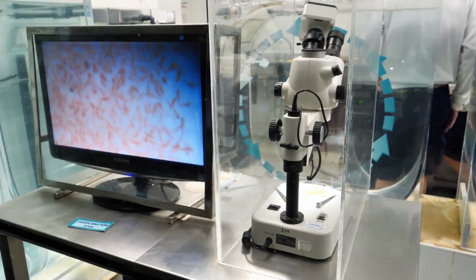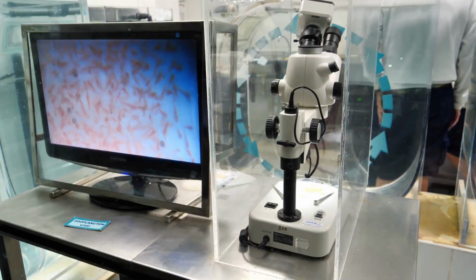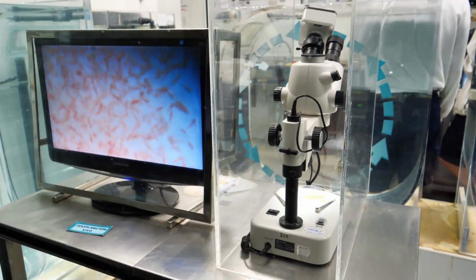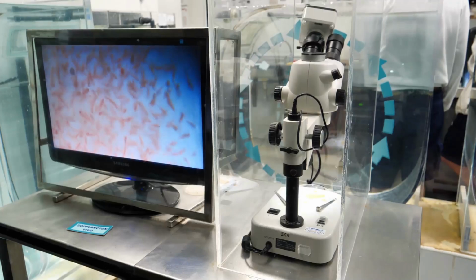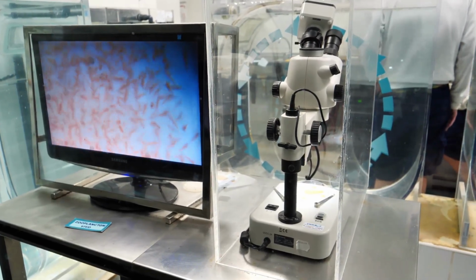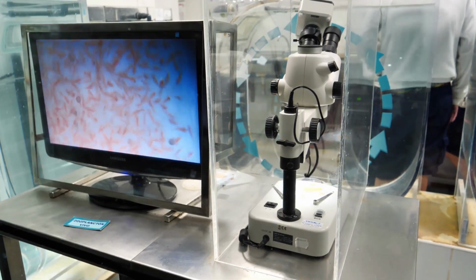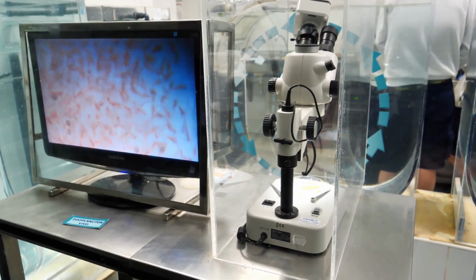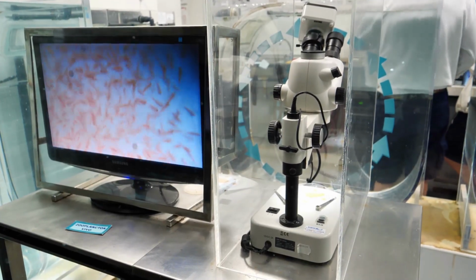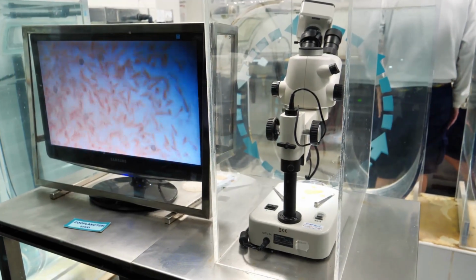Turn to an electron microscope when your absolute top priority is detail. If you need to see the precise structure of a virus, visualize the folds inside a mitochondrion, or examine the atomic lattice of a new material, you need electron microscope resolution. The trade-off: these machines are expensive, require highly trained operators, and involve complex, lengthy sample prep that kills the specimen. You get a static black and white image of unparalleled detail, but you lose the dynamic context of life.